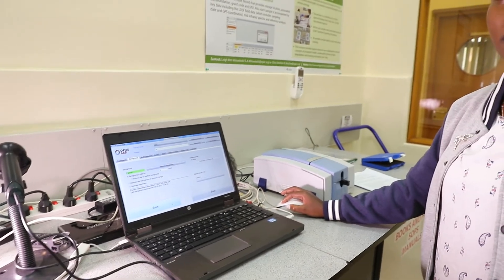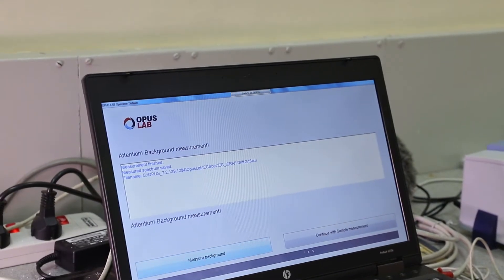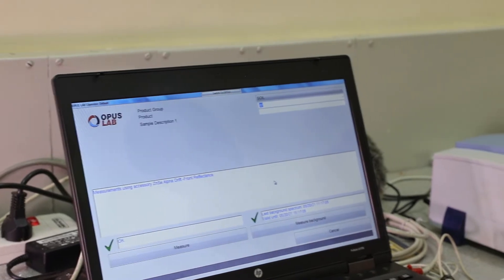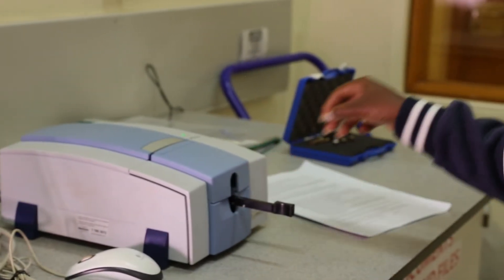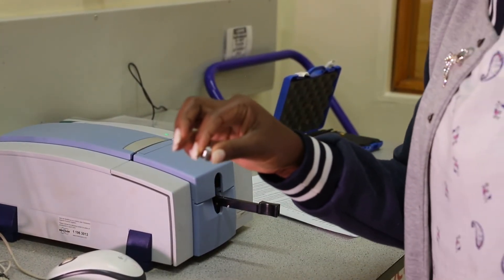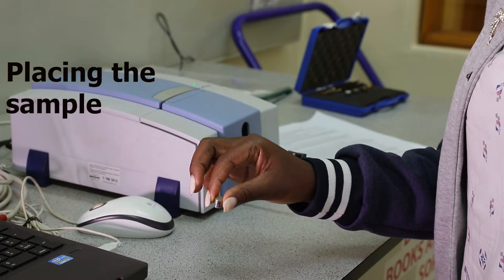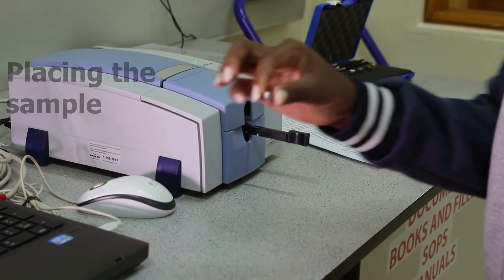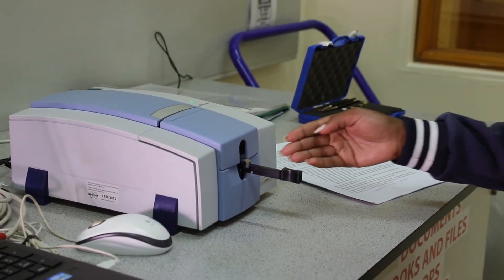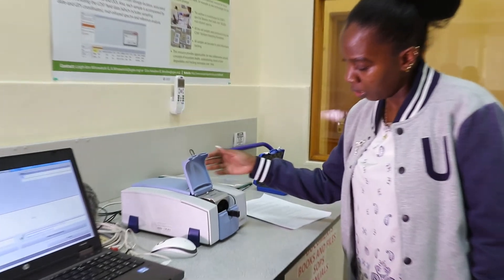After you have finished measuring the background, which takes 30 seconds, go to Continue Sample Measurement and start. You remove your gold reference cup from the cup holder and return it back. Then you take your sample holder, which has your sample — which is soil. For soil, the sample has to be ground to 0.05 mm in a steel cup. You place it into the sample holder. When loading your sample, make sure the sample is even on top. Then you place the sample in the machine nicely and close it.